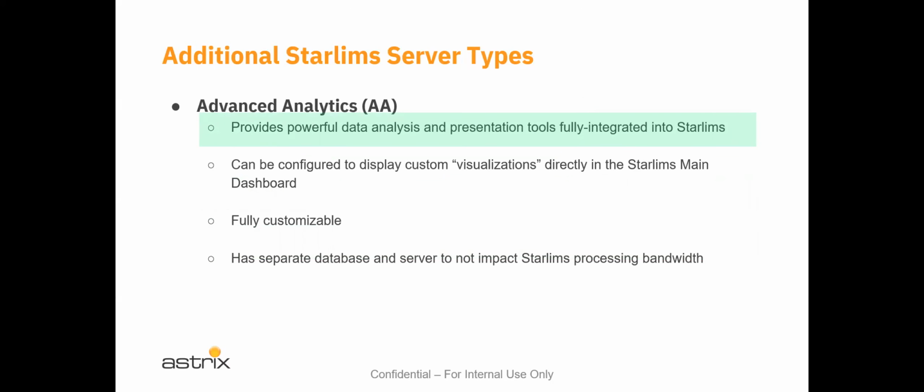So the advanced analytics, we spoke a little bit about that already, but it provides powerful data analysis and presentation tools. I might be able to give you an example of what that looks like, but I didn't include that in this presentation because I knew we weren't going to be talking about it much. It shows right in the center dashboard, and it's fully customizable.